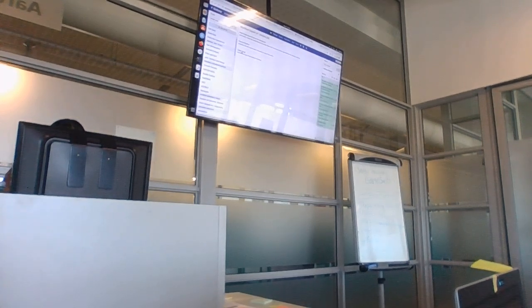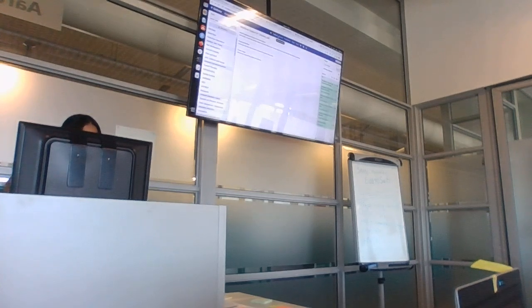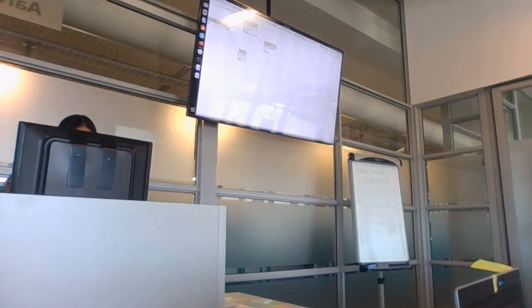Yes, it does say download, but there isn't an option to download. Let me see. If you use the menu at the top of your browser, does it have an option to save? When you export, you're looking at the image, and then at the top corner of your browser, no, the one next to it. Oh, you mean save it from here?